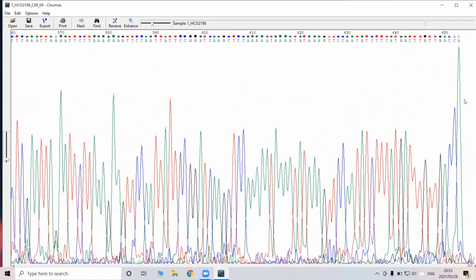And I'm happy with how the sequence looks. I couldn't detect any aberrations. When you're doing this, you generally would take a lot of time going through this. This is a sequence that I have worked on before, so most of the aberrations, if not all of them, have been found and altered.